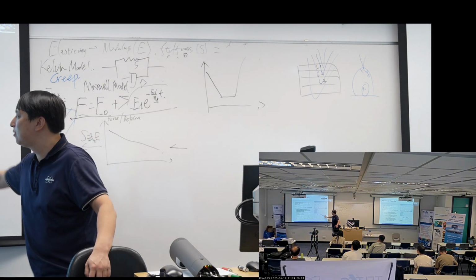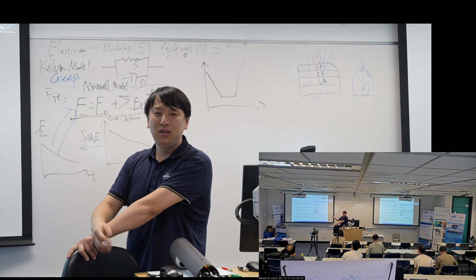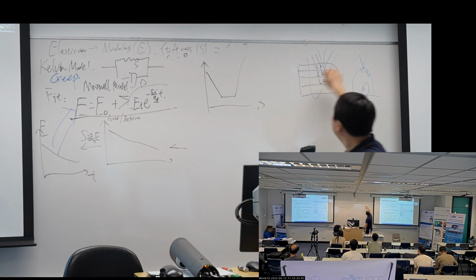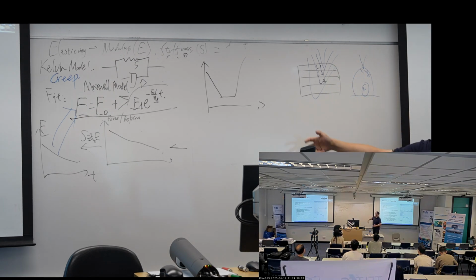The function is quite simple. It requires you to know your structure very well, because when you're moving down, you don't want to go to the 3rd or 5th layer or even damage your samples. So this kind of experiment requires some preliminary data, and then we can continue.